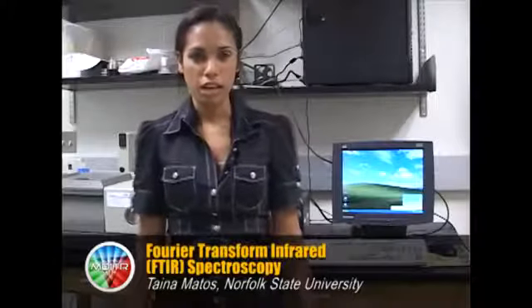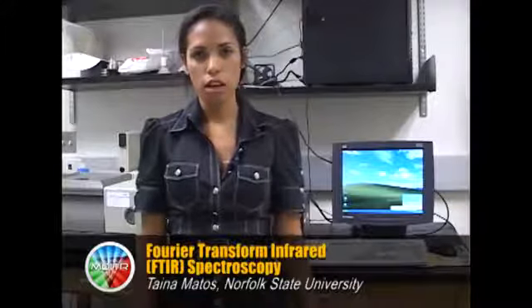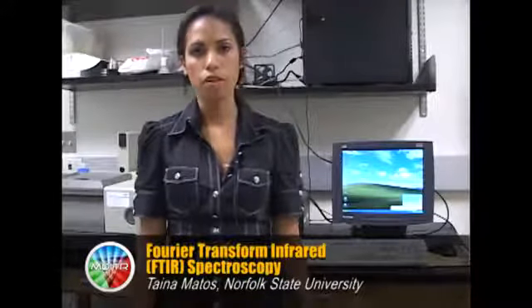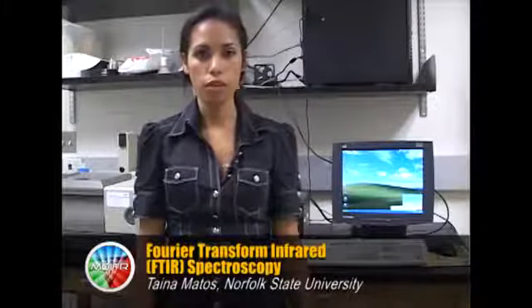I am a PhD candidate at Norfolk State University, and today I'm going to guide you through the usage of FTIR spectroscopy, or better known as Fourier transform infrared spectroscopy. And the reason why we tend to use this is to identify functional groups by their different vibrational modes.